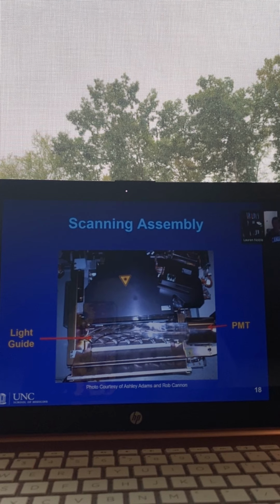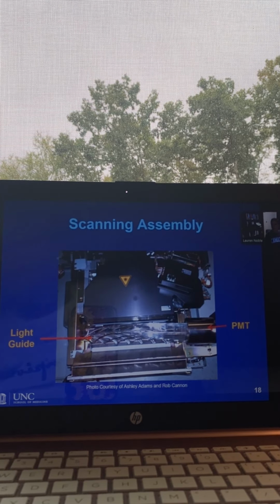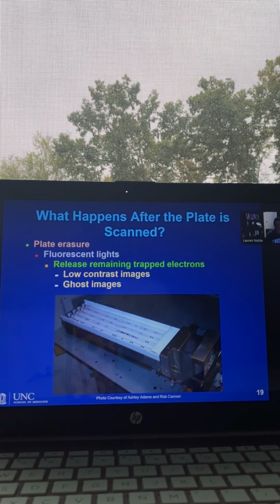The photomultiplier tube converts light into electrons. We won't go into detail about what the photomultiplier tube is made of, but it is a solid state type of conductor. All you need to know is that we end up with electrons. So you okay at that point? That whole process? Because you may have to list out those steps.